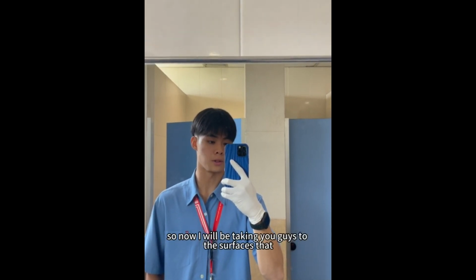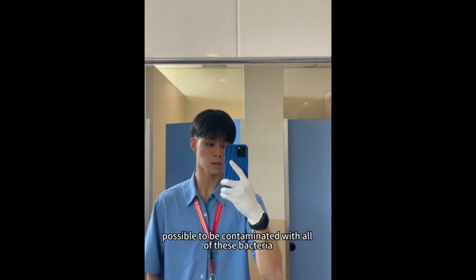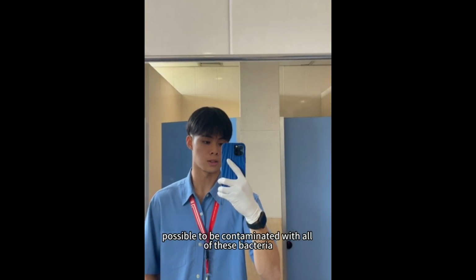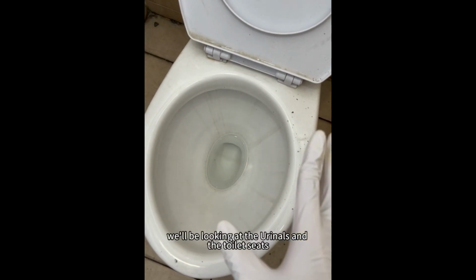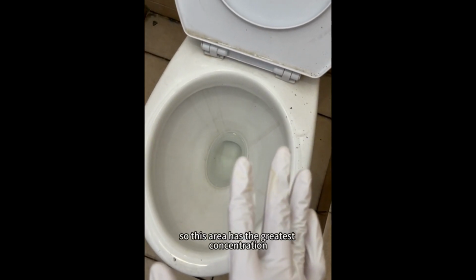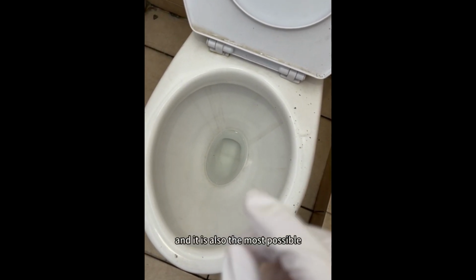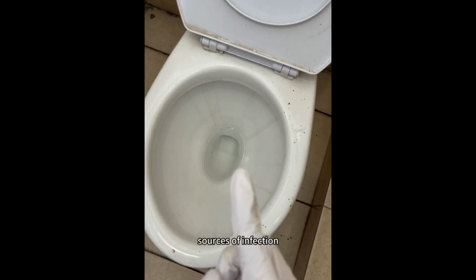So now I will be taking you guys to the surfaces that are possibly contaminated with all of these bacteria. Okay, so first we will be looking at the urinals and the toilet seats. This area has the greatest concentration of the fecal bacteria, and it is also the most possible source of infection.